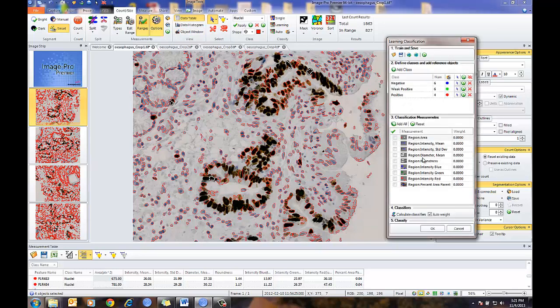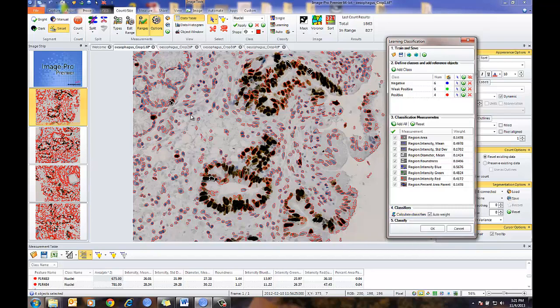Next step — these are my measurement parameters. I'm going to select them all and calculate my classifiers. Now you can see the auto-weighting. Based upon the objects I've selected and using all these parameters, it will statistically separate my objects using all parameters based upon this weighting. In this case, mean intensity blue channel is the most important, followed by region intensity mean — which uses a grayscale interpretation of the image — followed by intensity green. When I'm ready, I can press OK.